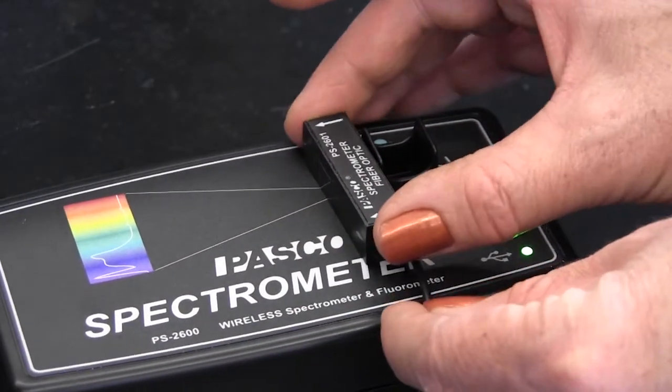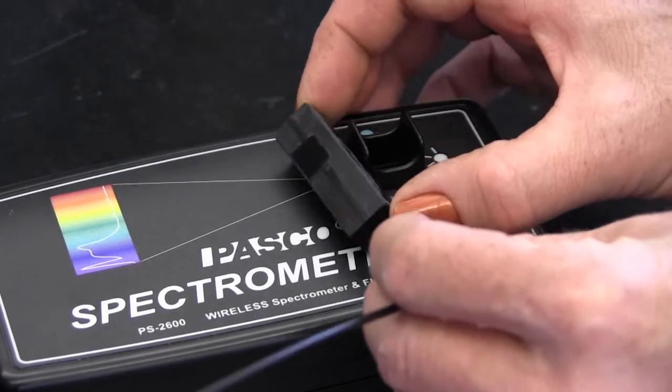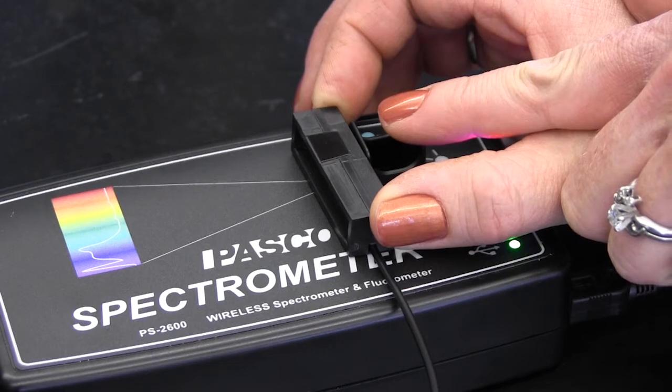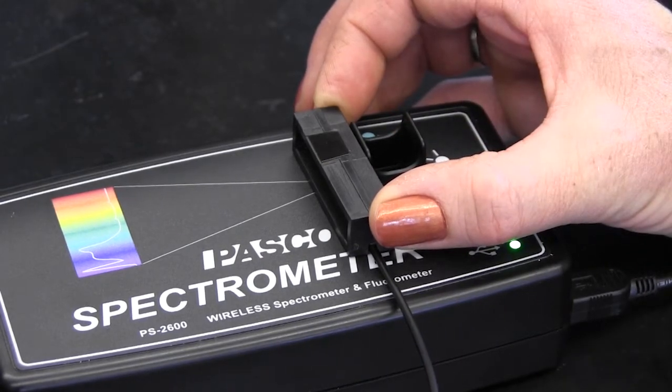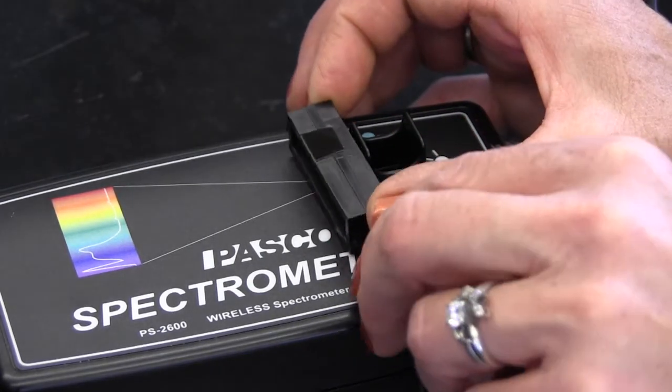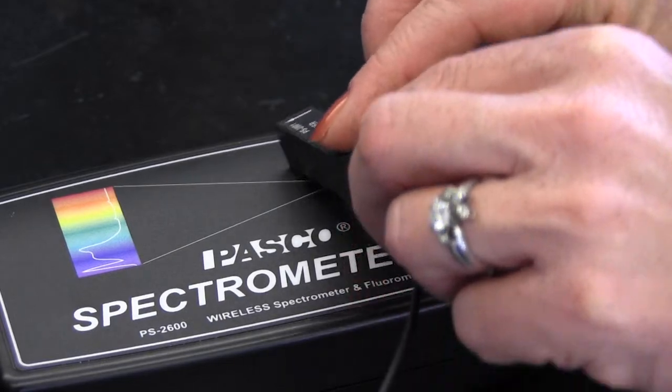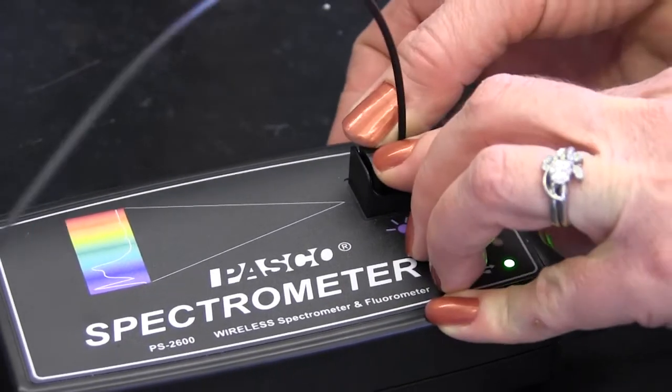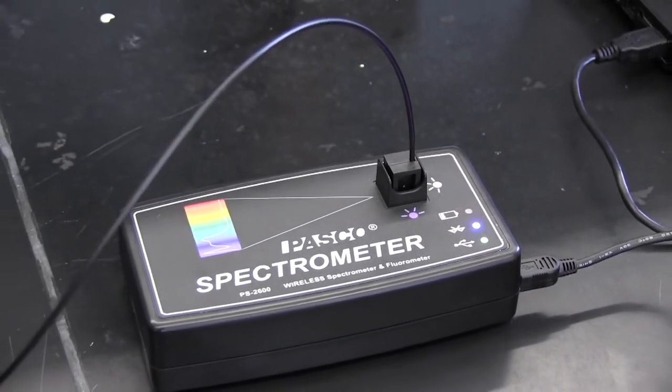The reason why the orientation matters is that on this face there is a window and so the light is going to come in through that window and you want to make sure that you don't touch that window with your fingers. So when you're ready to insert the probe, just grab it by the top and insert it firmly into your PASCO spectrometer.